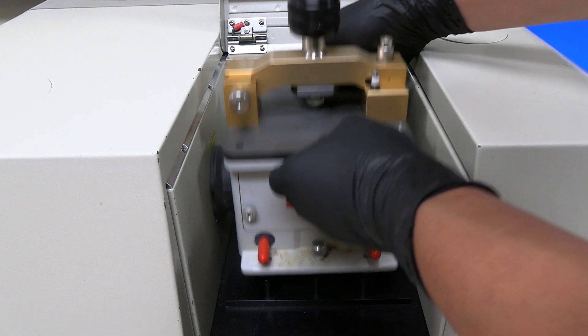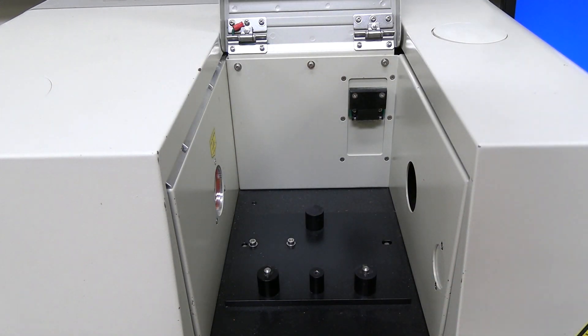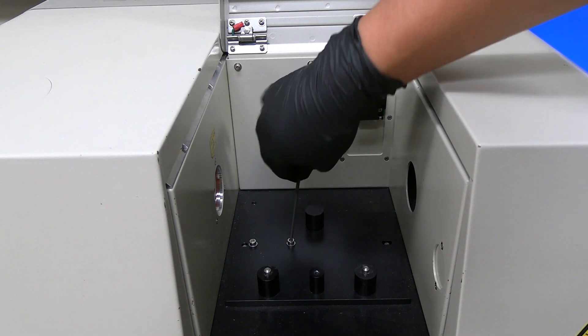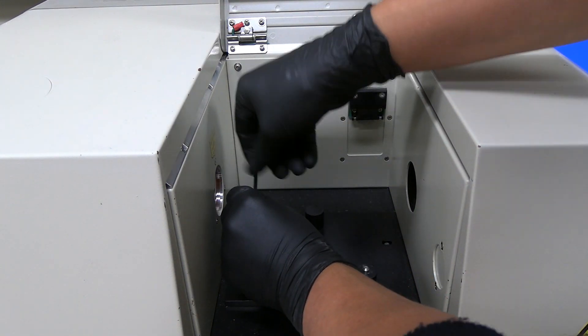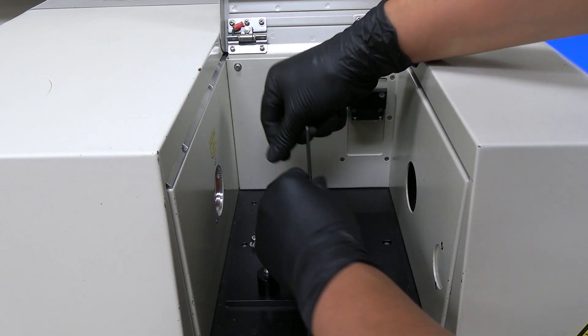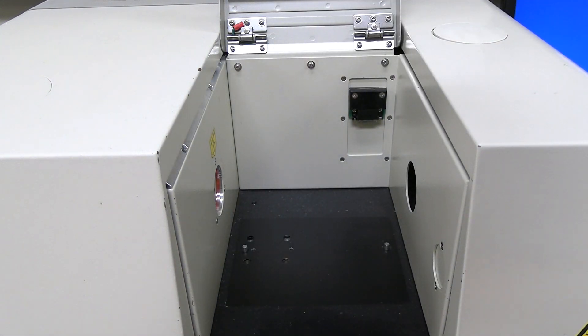Grab the ATR from the platform and carefully pull out the ATR from the cell chamber. Use an Allen key to loosen the two screws that secured the base to the instrument. Be careful not to touch the window on the left side of the cell. Pull out the base plate from the cell chamber.